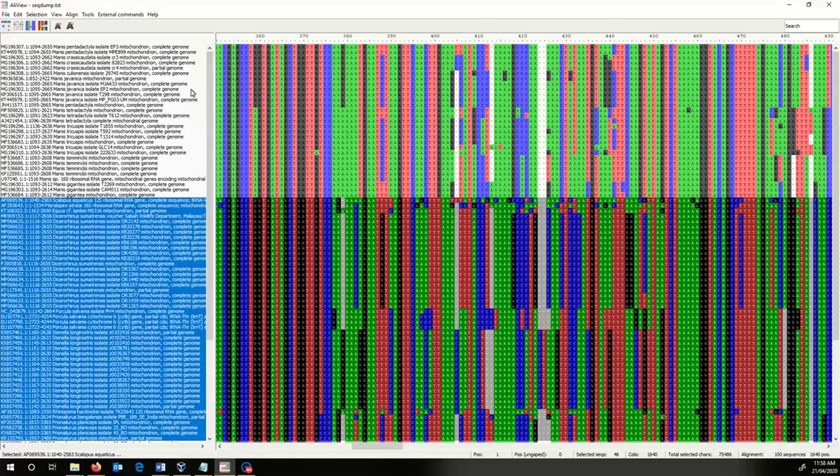And Javanica is down there, and that's different from the others. So it looks like there's enough information there to delineate species. Even if we just amplify this short bit of DNA, and we might need to amplify a little bit more just to make it good, we would be able to get a consistent answer there.